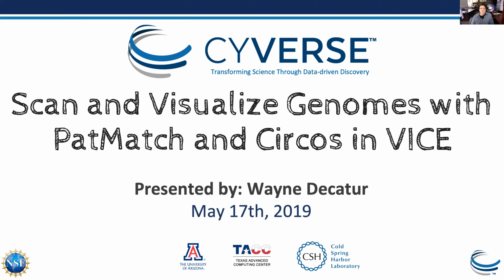Anyway, today's webinar is on how to scan and visualize genomes using PatMatch and Circos in the CyVerse discovery environment, presented by Wayne Decatur of Upstate Medical University in New York.